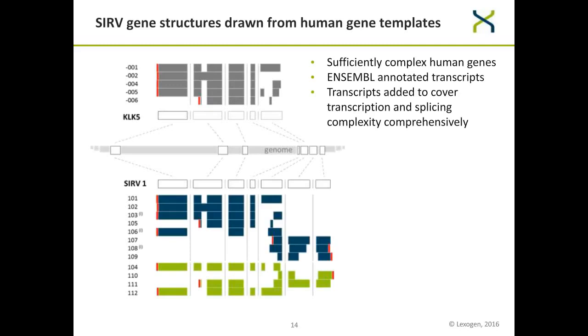Also, vice versa, we have one annotation version, the insufficient annotation, where we remove some of the transcripts from the annotation that are actually present in the mix. That would be the situation where you have to deal with a not well annotated transcriptome, or where in your sample there is a new transcript variant that has not been annotated before and that you have to deal with anyway.